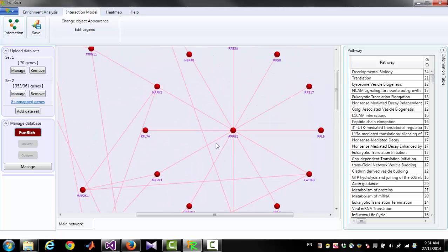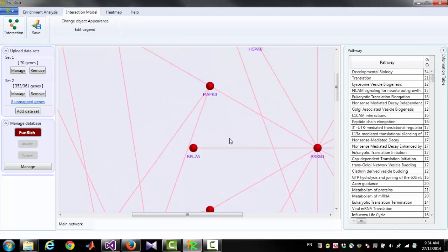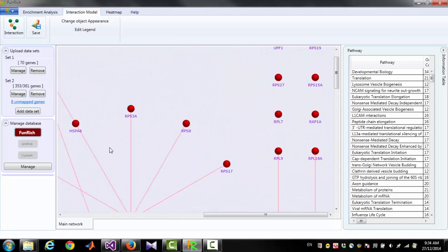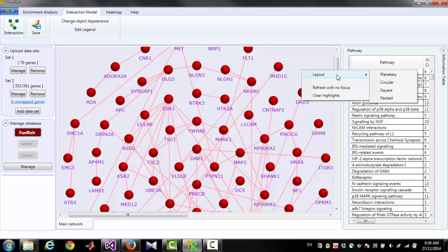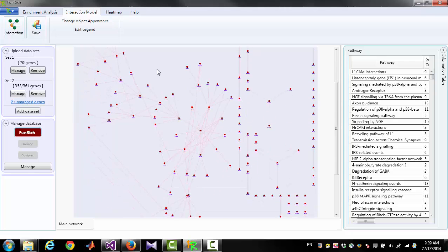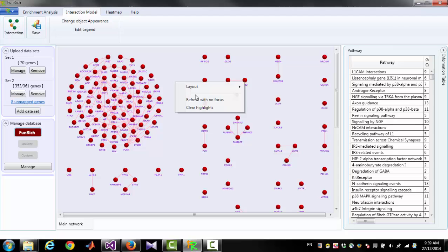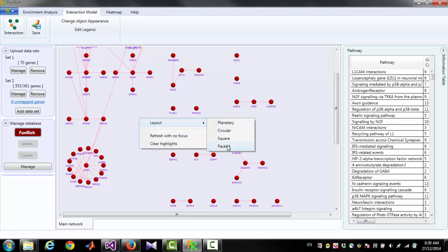You can zoom in and zoom out using the mouse scroll and also navigate to different locations of the diagram. If you right-click on the empty space, you will get an option to change the layout — for example, planetary layout, circular layout, square, or packed.